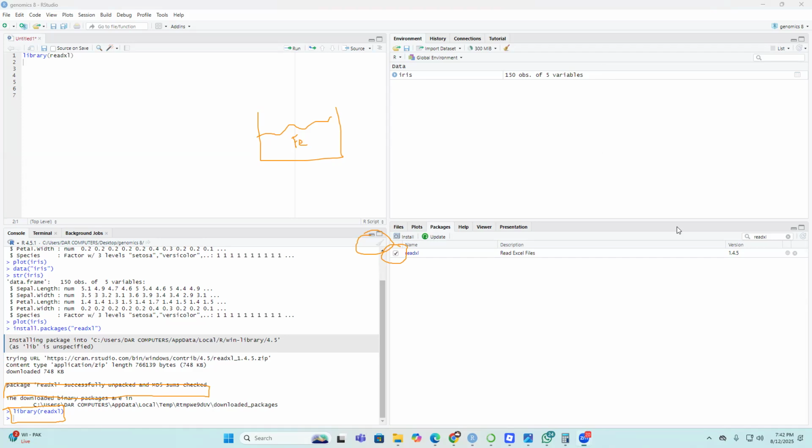Please all participants activate your package and type done. For activation, you need to run the library function. I need a response from all participants.